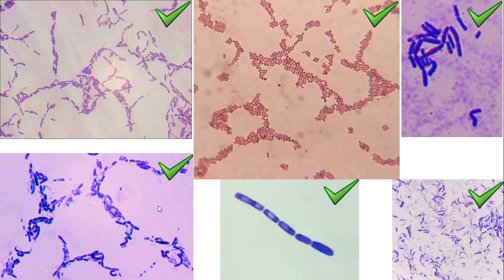The ultimate objective of gram staining is to get isolated single cells. You should be able to observe, somewhere in the field of view, a single cell. Then you can evaluate whether they are gram positive or not. Purplish means gram positive. This is an ideal gram positive. Mostly they are gram positive.